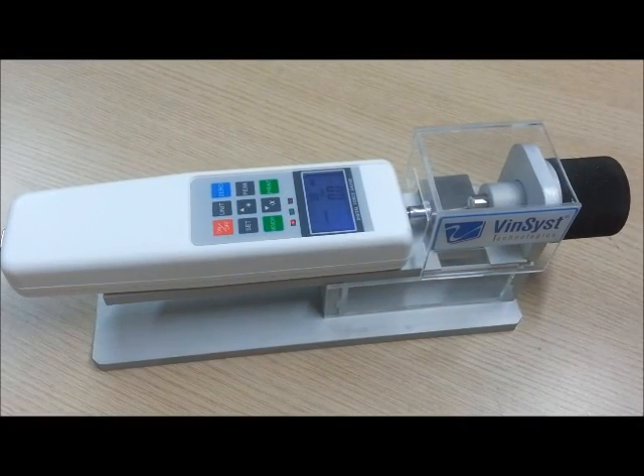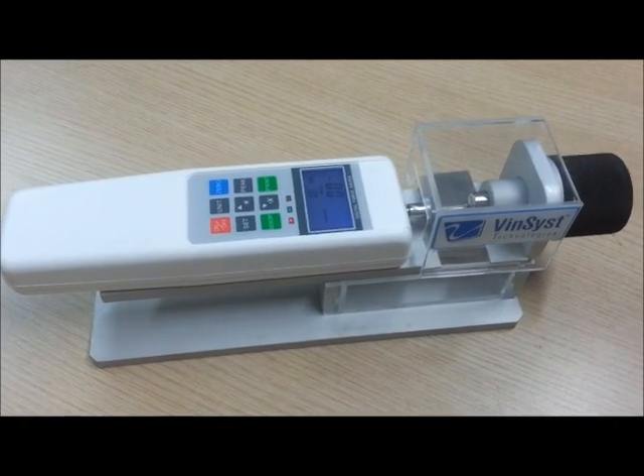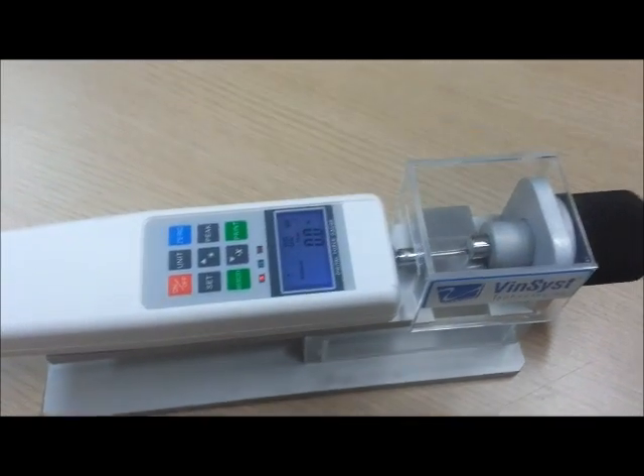Presenting the Digital Portable Tablet Hardness Tester from VinSyst Technologies. We will see a quick demonstration for the instrument.